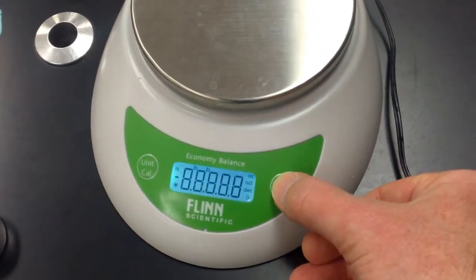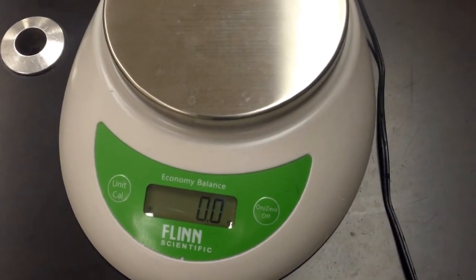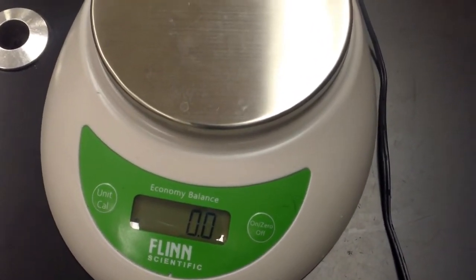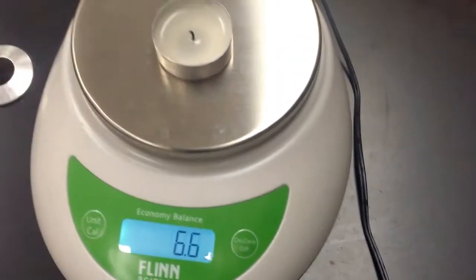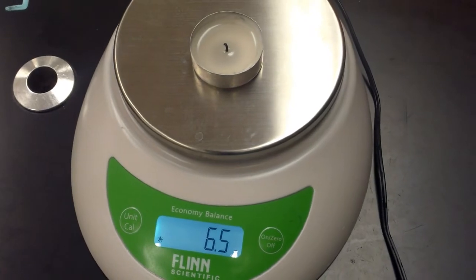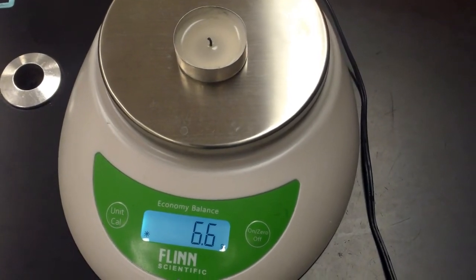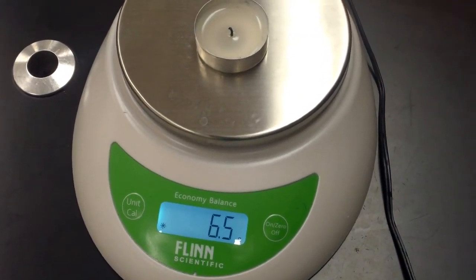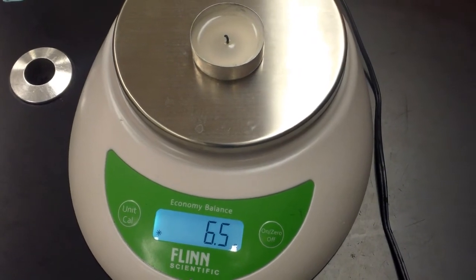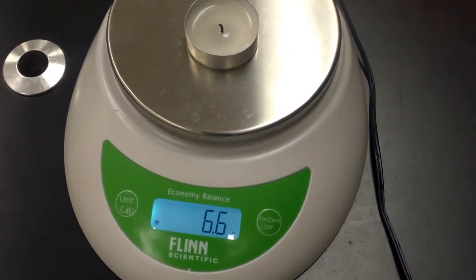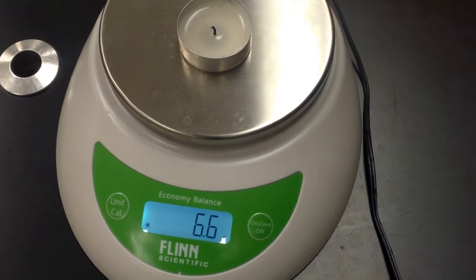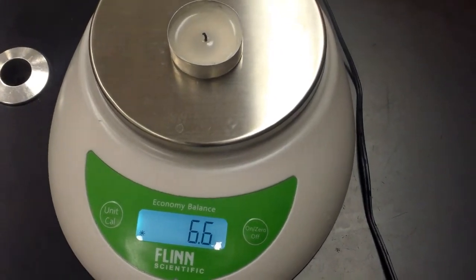Let's turn on the balance. Just make sure it's properly zeroed. And we'll measure the mass of our candle. Okay, the candle is now measuring 6.6, 6.5, 6.6. We'll record that as 6.6 grams.